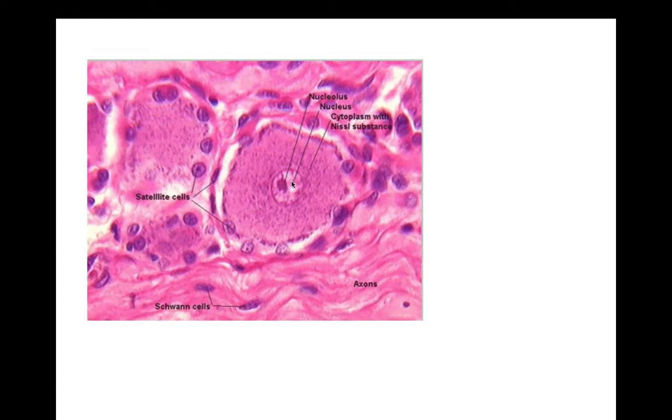Here's another picture pulled from the web, a little bit closer. You can see the satellite cells making a little ring around our neuron. Here is the nucleus and nucleolus of our unipolar neuron. Make sure you know that.